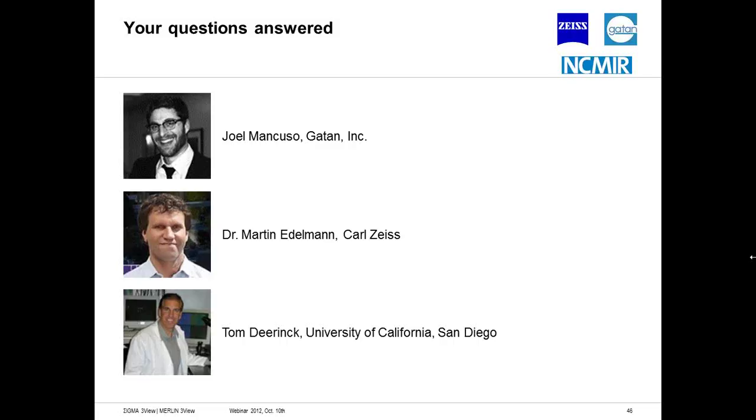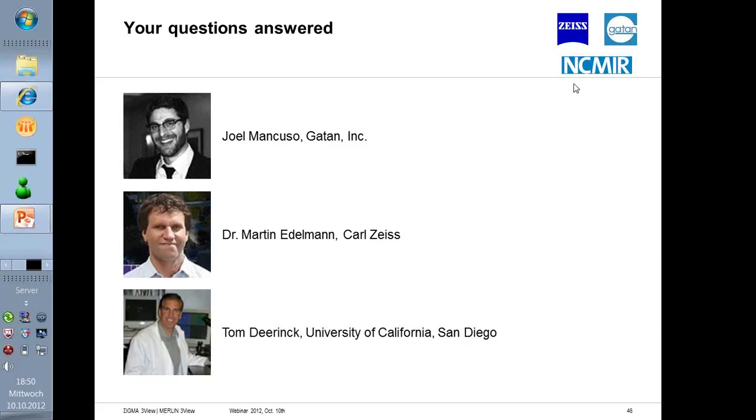Yeah, no problem. So the 3View 2 comes in two flavors, the XP and then just the standard 3View 2. With the 3View 2 we took a bunch of the automated features and changed the stage from an automated click and point type stage to a manual micrometer stage. So the stages have to be manually moved by hand. The other important note for the 3View 2 is that the cutting thickness specification is 30 nanometers.